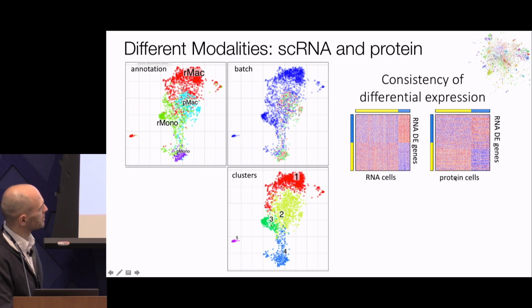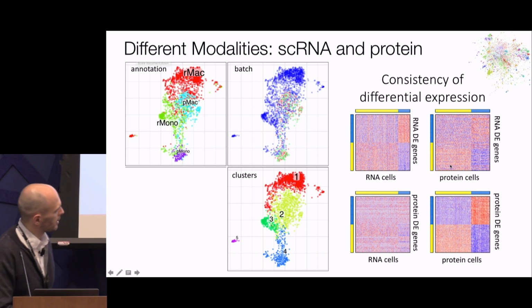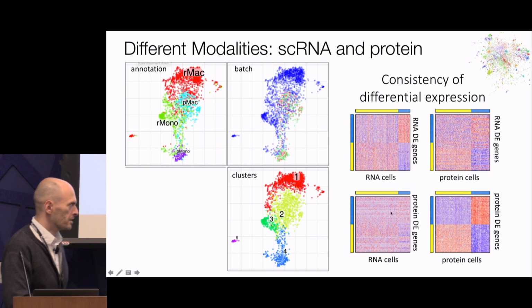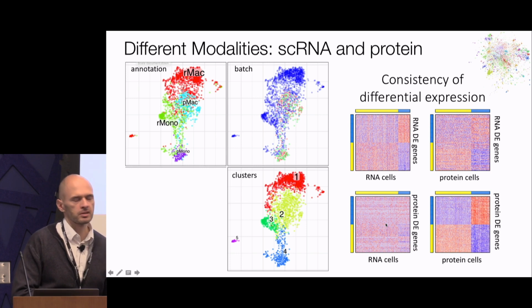And visually you could tell, especially in the monocytes, that they're differentially expressed as well. Now this is doing a flip side. So here we determine differentially expressed proteins, basically, using the protein cells. And you see the nice layout here. And then look back in RNA. Not so nice. You could see some downregulation here, but generally speaking, things are a lot more washed out.